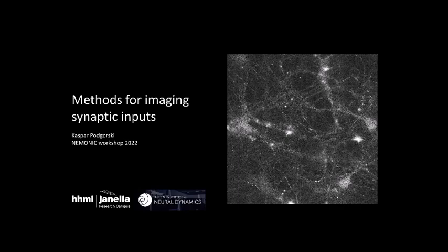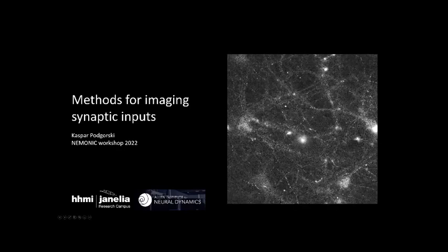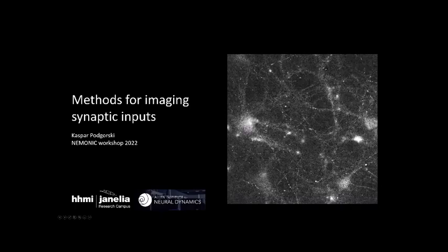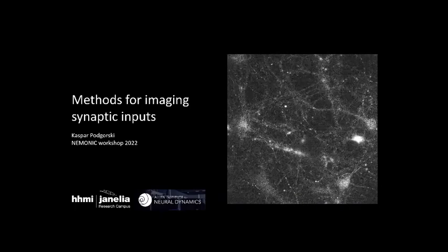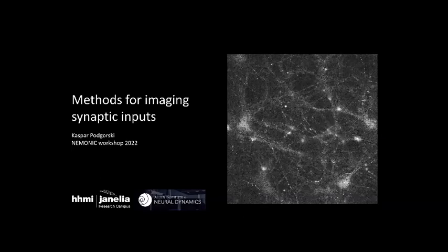So I'm going to talk today about work that my lab has been doing to establish methods for recording large numbers of synaptic inputs from individual neurons, especially in vivo. That means both indicators and microscopes towards this goal.